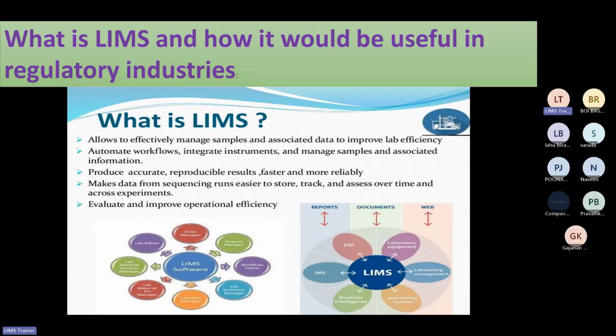Also there will be some accuracy in the work, because in manual work there are chances of human error. So the human error will be reduced by utilization of the software. It makes data sequencing runs easier, to store, track, and assess over time.